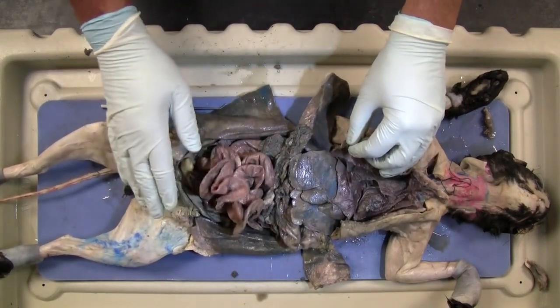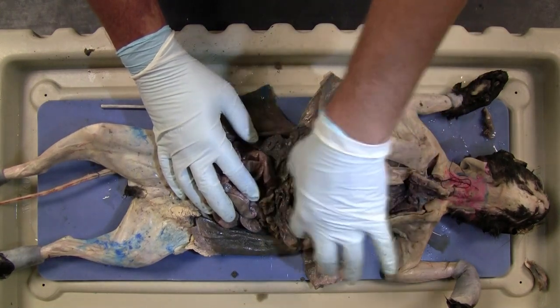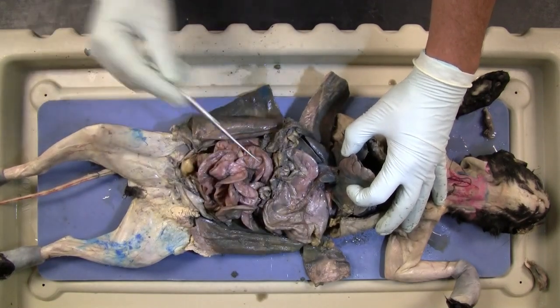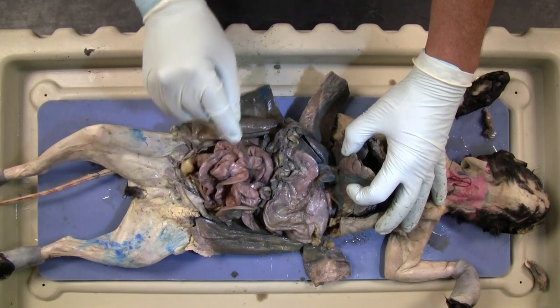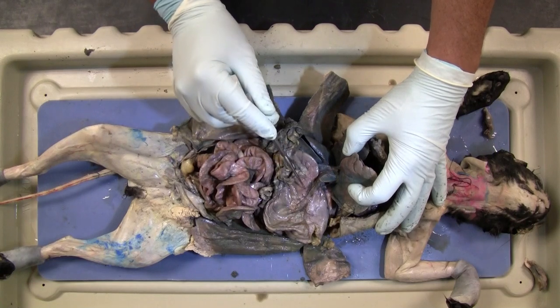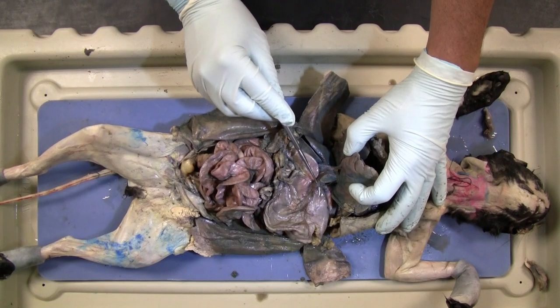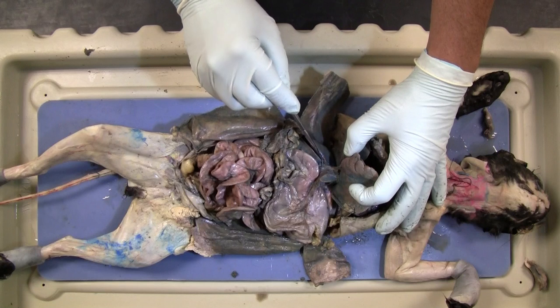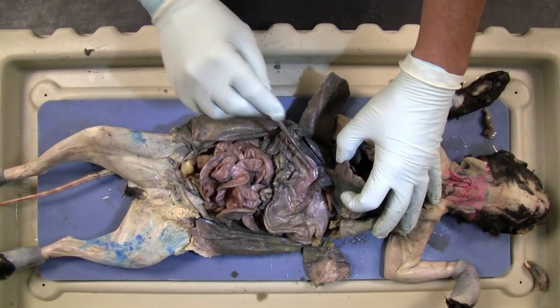Now once you find the major parts of it, you're going to look for the omentums. So if you pull the stomach up, you're going to remember there's going to be the lesser curvature of the stomach, and greater curvature of the stomach is where you're going to find your omentums. The lesser curvature of the stomach to the liver is where you're going to find your lesser omentum. So all of this is your lesser omentum.